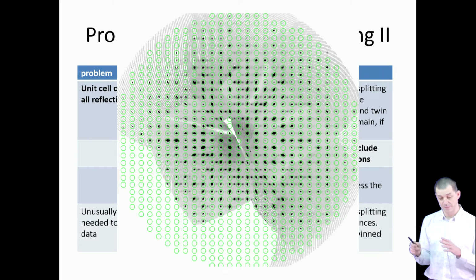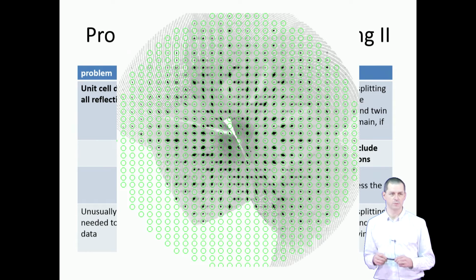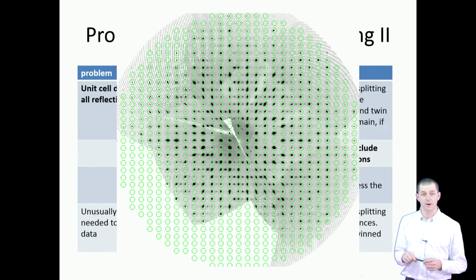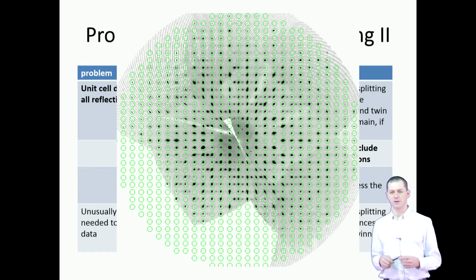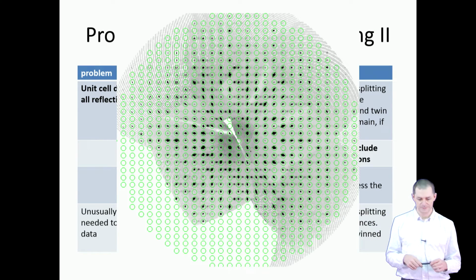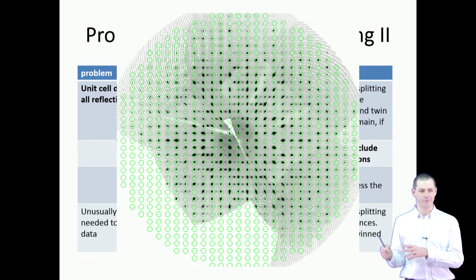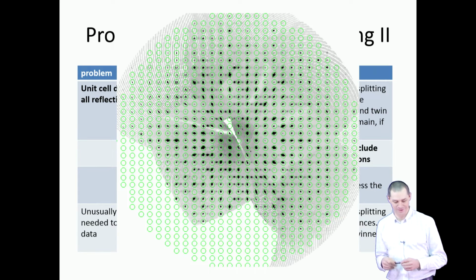So these days it happens less, but especially if you work with structures from databases that were determined prior to, let's say, 1990, you should keep in mind that they may not be as disordered as they appear. There might be a hidden ordering that was missed. I don't want to imply that all the structures prior to 1990 are wrong. Definitely not. There is just increased danger.